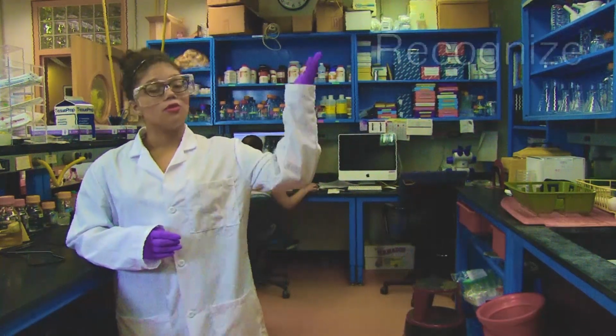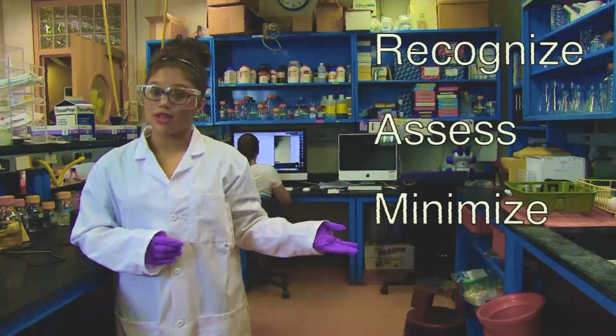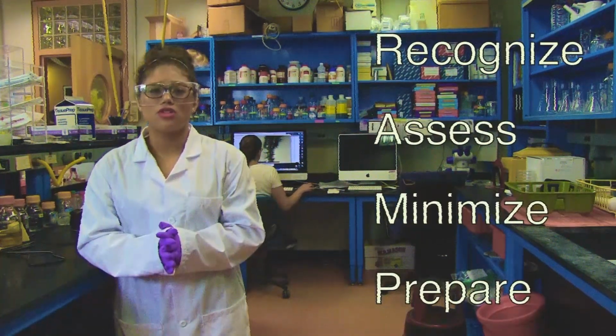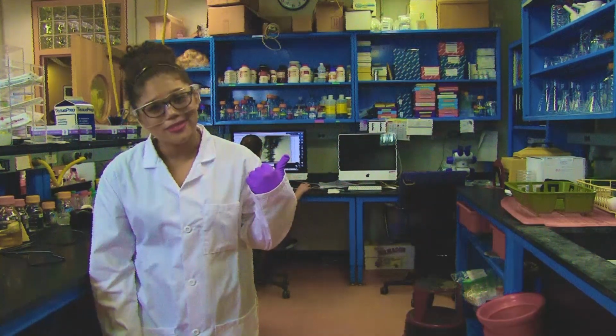RAMP stands for Recognize the Hazard, Assess the Risk, Minimize the Risk, and Prepare for Emergencies. You can employ RAMP in any situation in which you might encounter a hazard. Why, just take a look at Wendy.